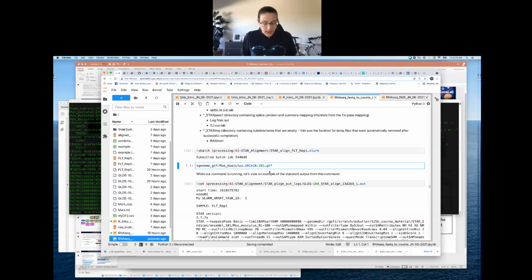So looking at that again, we could use that cat command to open it up. And then I talked to you guys about that function of wc -l to count all the lines of a file. As that's running, it's opening up that GTF file, the annotation file that we use, and it's going to tell us the number of lines.